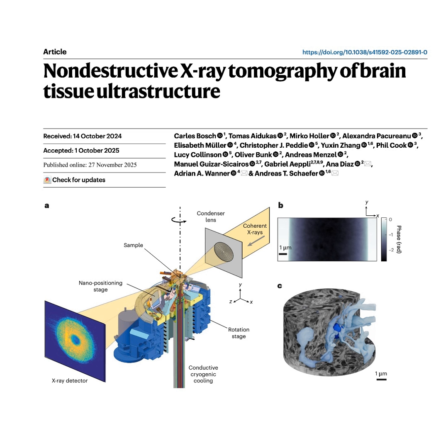So we've moved from a scientific impossibility to a scalable, non-destructive reality. And with fourth generation high-brilliance X-ray sources becoming more available, this isn't just some bespoke lab technique anymore. No, it's becoming a powerful new part of the connectomics toolbox, really ready for prime time. It's just an elegant example of how solving one big limitation requires this multidisciplinary approach. Right. They had to borrow materials from nuclear engineering, use cutting-edge cryogenics, and deploy these incredibly sophisticated algorithms that correct for movement. All just to let the fundamental physics of X-ray imaging finally work. It truly removes that radiation damage limit, paving the way for 3D tissue mapping that just wasn't scalable before.